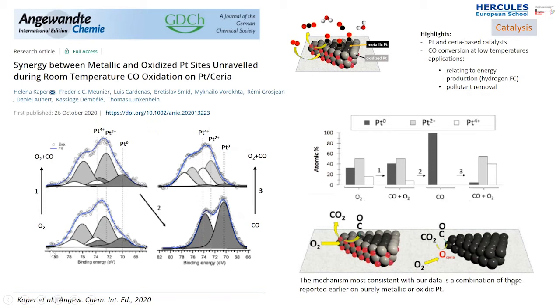We mounted it in a metal mesh and spot welded it on the surface. So we are dealing with different kinds of materials, and you always have to think and come up with some good way to mount the sample for the measurement. And we introduced the oxygen to the sample.